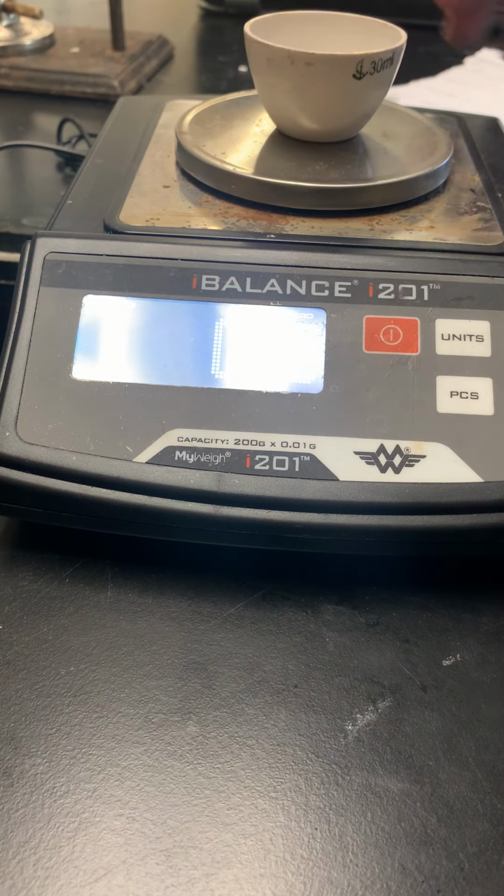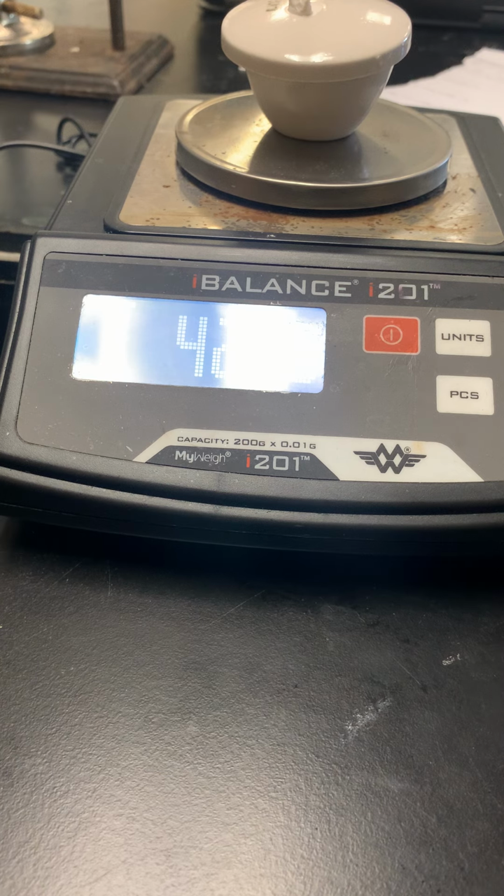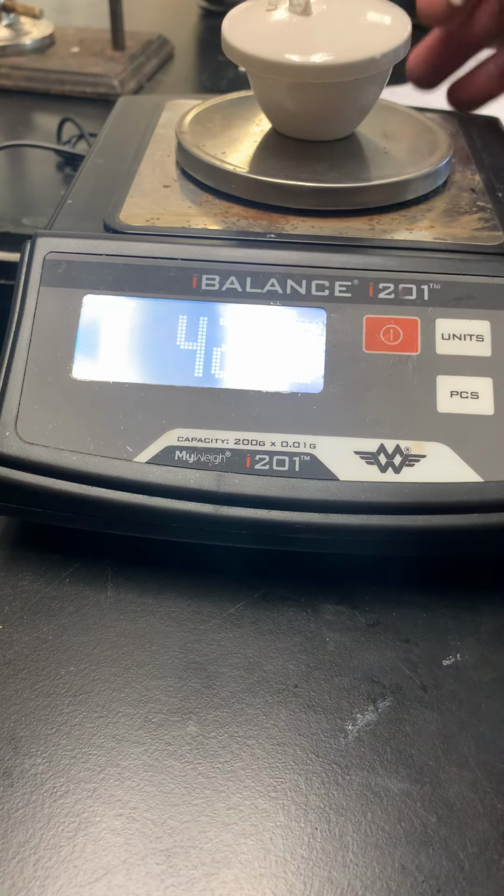This is the reaction of magnesium and just burning magnesium in air. So you need a lid. So we're going to put a lid on. So the crucible and the lid weigh 42.03. And we can't see that again.